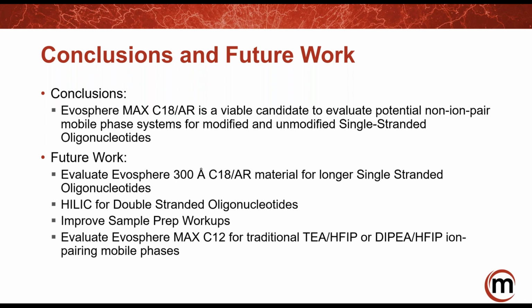We are evaluating HILIC in the monodisperse particle technology for very polar double-stranded oligonucleotides. We have a collaboration to look at how to improve the sample workup and sample prep using some novel technologies there.